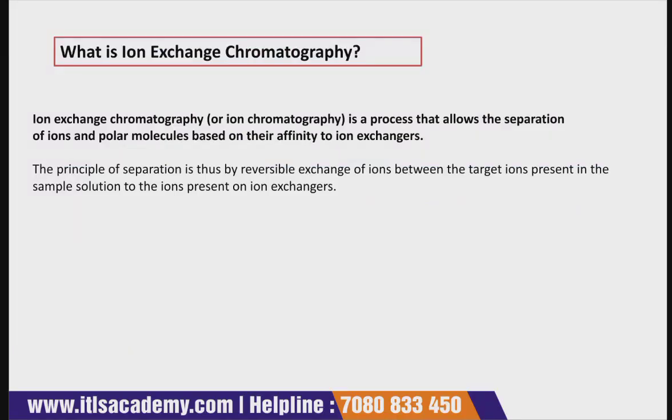Since the name suggests ions, in this type of chromatography we are going to talk about ions, that is anions and cations. So ion exchange chromatography or ion chromatography is a process that allows the separation of ions and polar molecules based on their affinity to the ion exchanger.